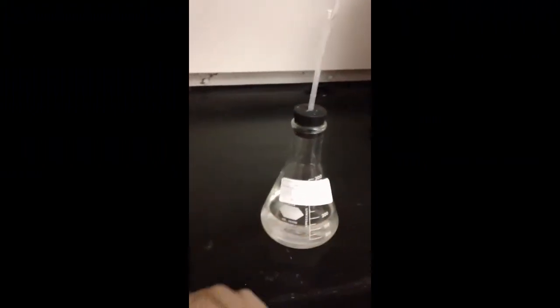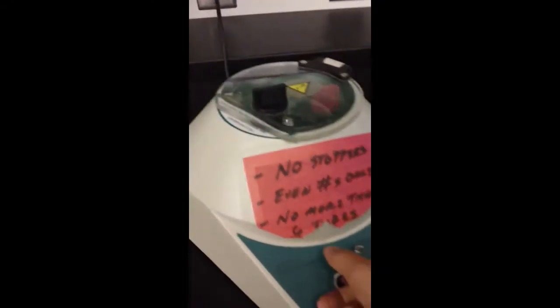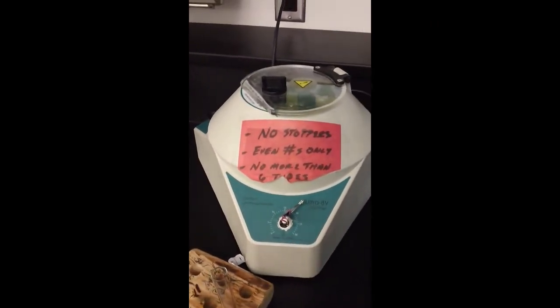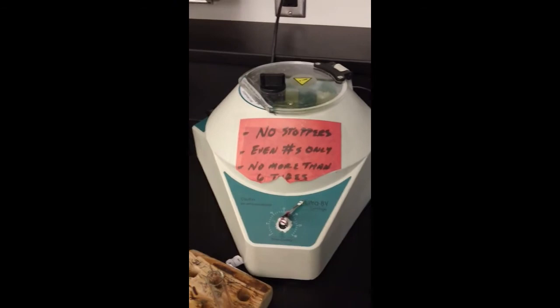Okay, so now what we're going to do is take this over to the centrifuge. We want to make sure that we balance the centrifuge, so I'm going to run test A and test B in the centrifuge, but I'm only looking for the results for test B. Okay, so I'm going to start it. And I will come back when it is finished to show you the results for test B unknown.